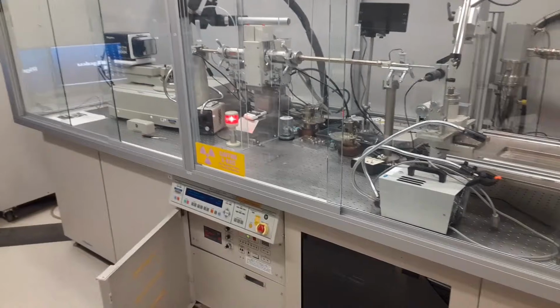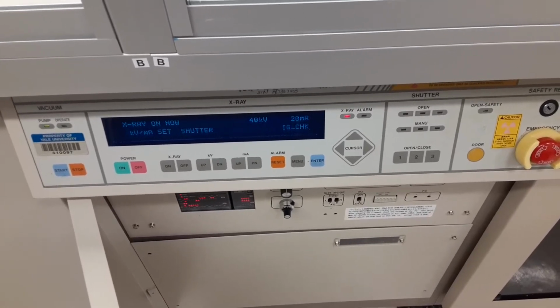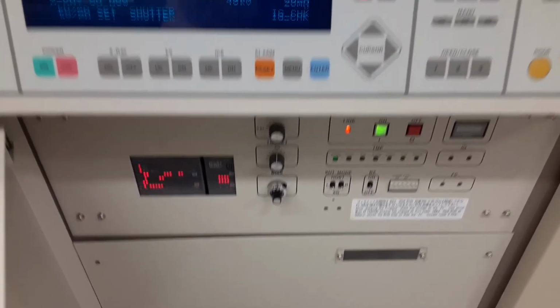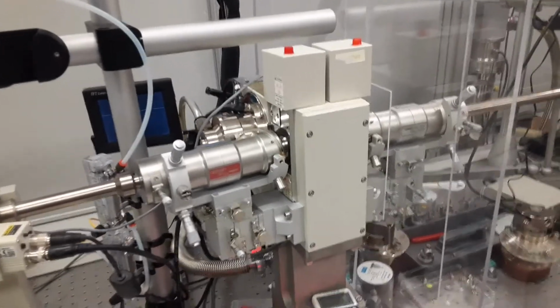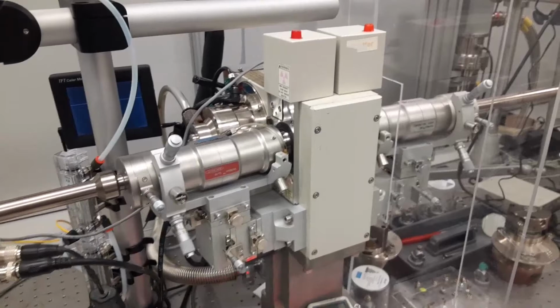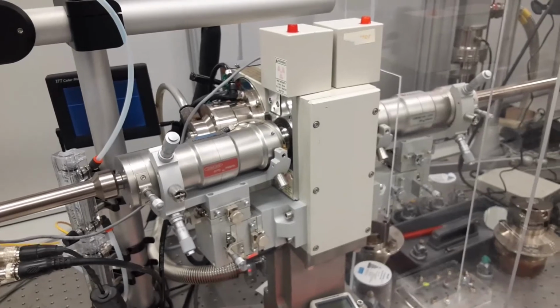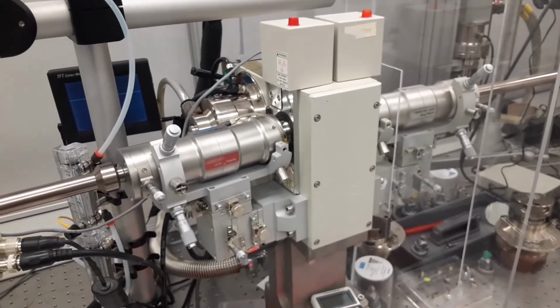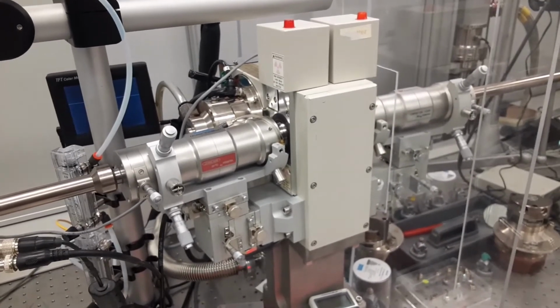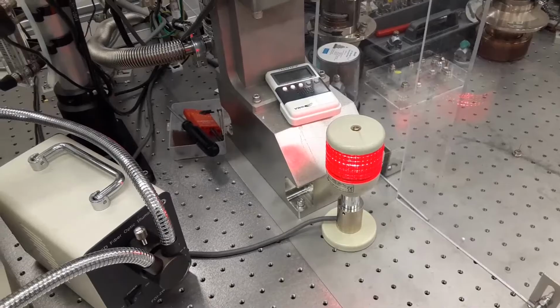Okay, so an overview of each of the physical components of the generator. Down below here we have the control panel, which allows us to turn it on and off and adjust the settings. Below here are the advanced settings for administrator operators. So the X-rays are generated within this copper box located right here, which is under high vacuum at all times. Inside is a rotating copper anode and a tungsten filament, between which 40K volts and 20 milliamp current goes. I'll get more into the rotating copper anode in a moment. This red light here indicates that the instrument is on and that X-rays are generating within the tube.